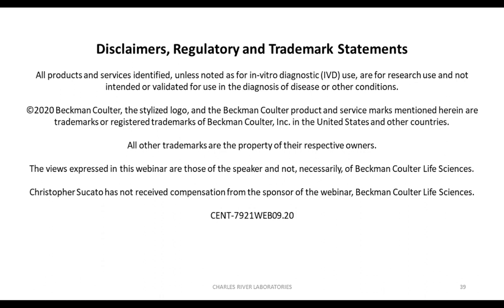Now, these methods may have some improvements in the very near future that put those methods, in terms of the baseline resolution that they can achieve, potentially on par with AUC. At present, we know of no method that can surpass AUC in terms of the data quality, the separation of these peaks, the empty and the full, the baseline resolution, and the good signal to noise.